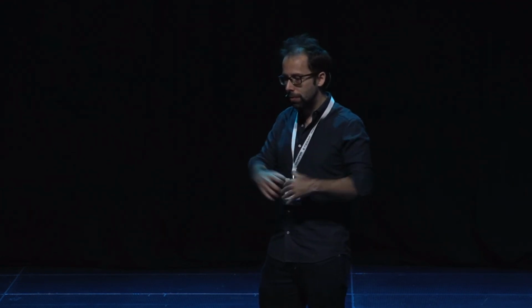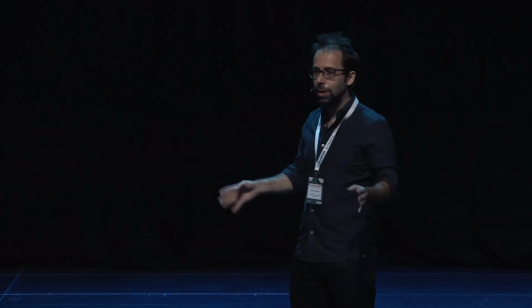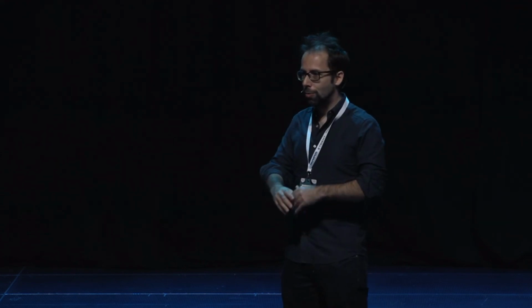These are very powerful tools, but as with anything in biology, we've been using Western blots for decades, and we use them every day, but in the back of your mind, you know how artifactual they are also, right? Because we've been using them for decades, we know how to deal with those artifacts. The same thing happens here in machine learning. You always expect defects in the data. That's true for super resolution, for machine learning, and so on. Then it's just a question of how you can validate and interpret them, because there is important data among those defects that always exist there.